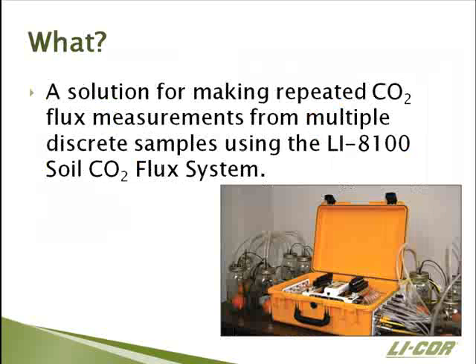What we're doing is we're providing a solution for making repeated CO2 flux measurements from multiple discrete samples. In its normal configuration, the LI-8100 soil CO2 flux system is used to measure CO2 fluxes from soil. So you have a chamber that sets over a continuous body of soil and it accumulates CO2, and we calculate a flux from that rate of accumulation.